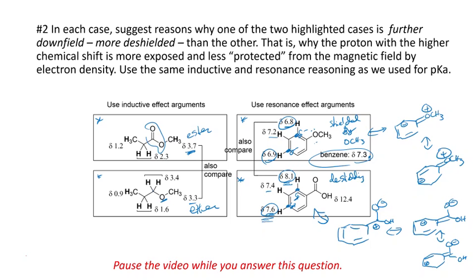Very, very dramatic. And I just want to point out that the hydrogen next to these 2 groups is at a tremendously different chemical shift, 6.8, 8.1. These are highly indicative of the sort of groups that are around the benzene ring. When we have a donating group, OCH3, we're liable to see hydrogens that are to the right of 7. And when we're deshielding with something like a carbonyl group on the ring, we could easily see aromatic protons way down at 8.1. And that is really very unusual. So it's something to think about and something to put in your back pocket as something you can use quickly to make a judgment.